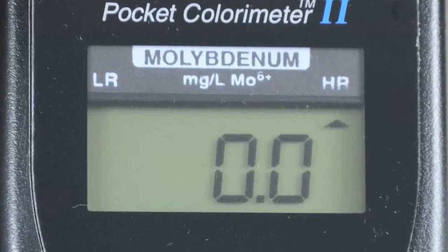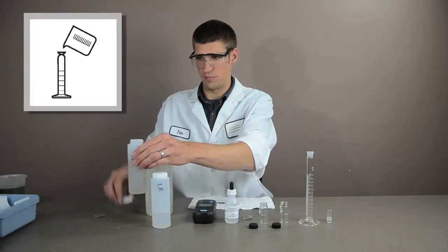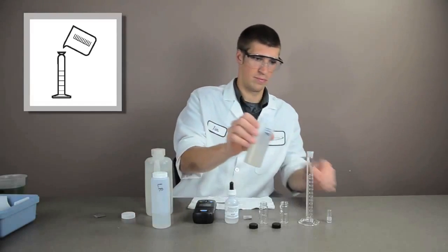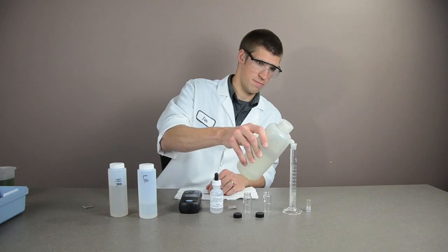To begin the high range test, switch to the high range channel in the menu function. Fill a 25 milliliter mixing graduated cylinder to the 5 milliliter mark with sample. Using DI water, dilute up to the 20 milliliter mark.